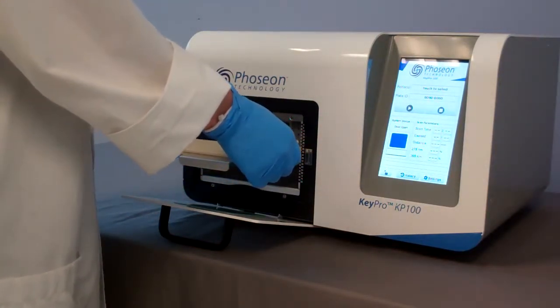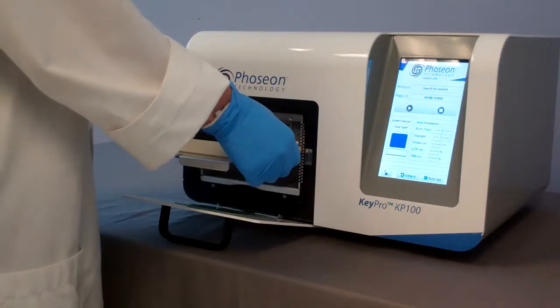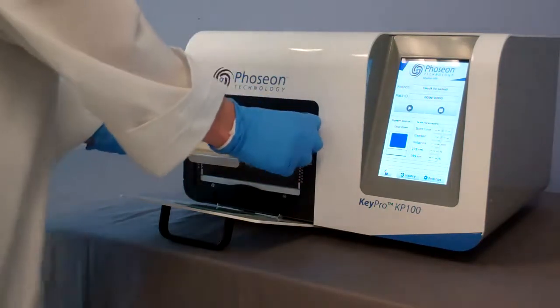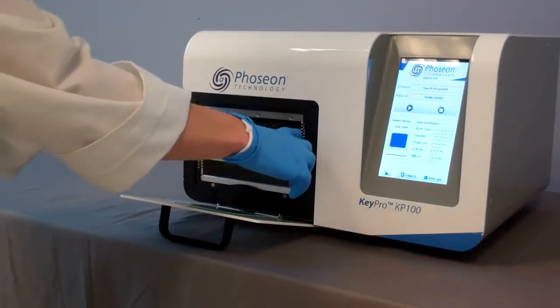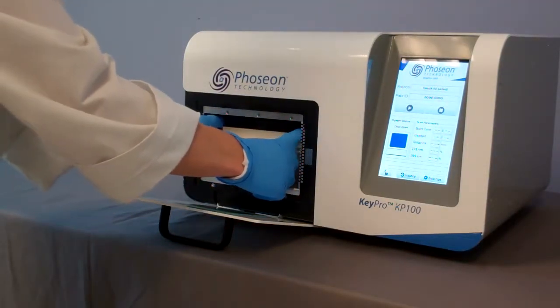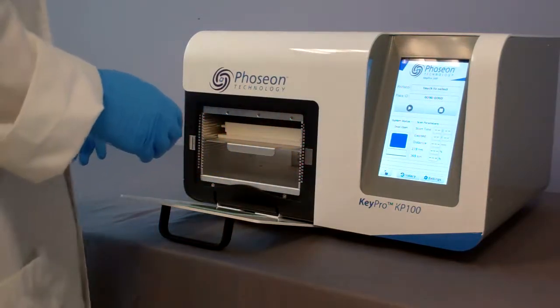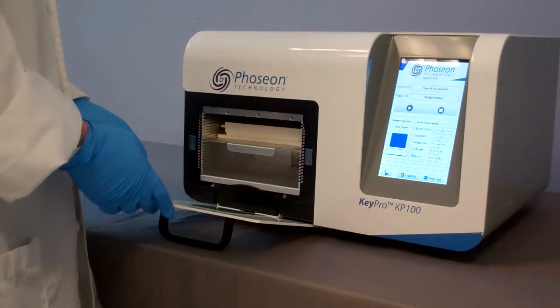Press down on the wings of the top section of the tray so that the top of the microplate is below the top of the chamber. Then push the shelf and the microplate into the chamber until the shelf is fully inserted, making sure the alignment guides stop against the back of the chamber.